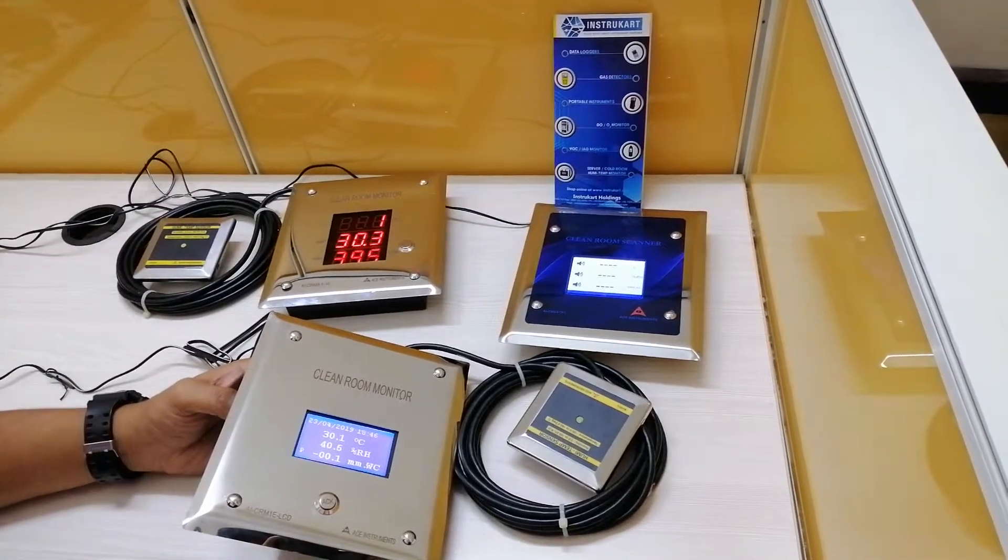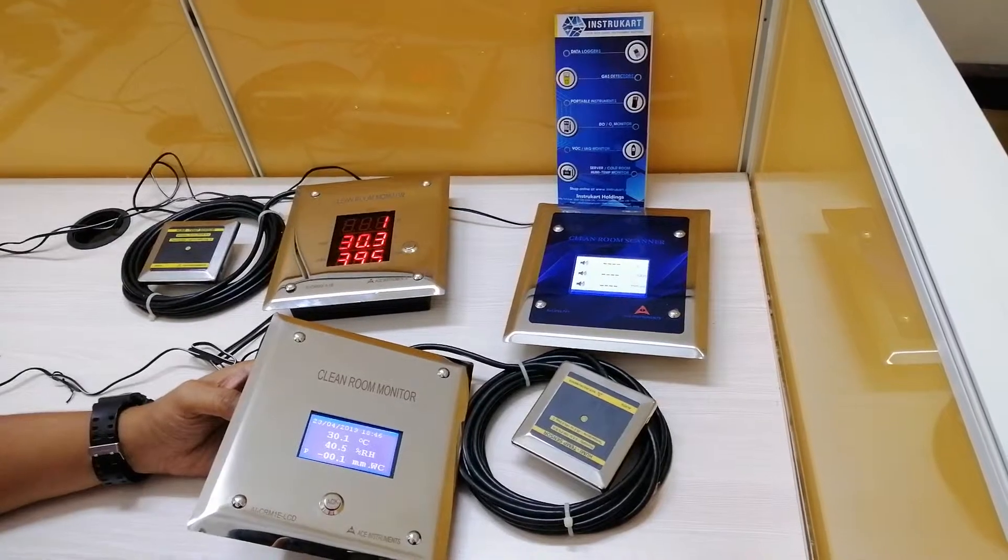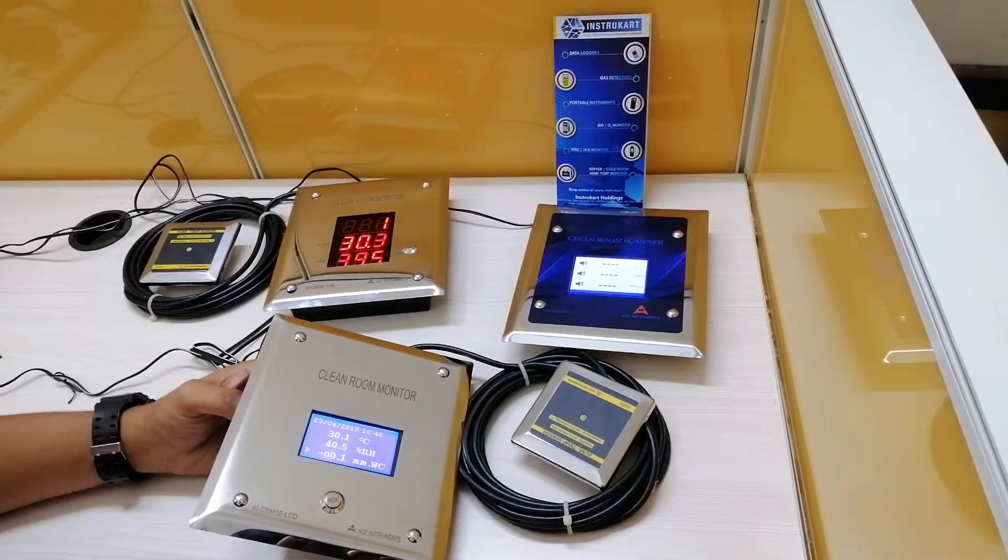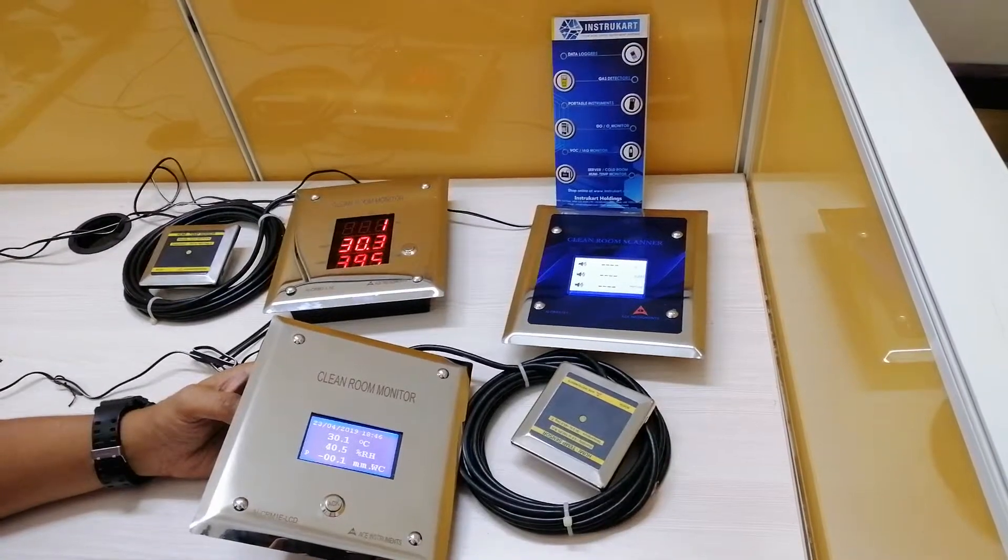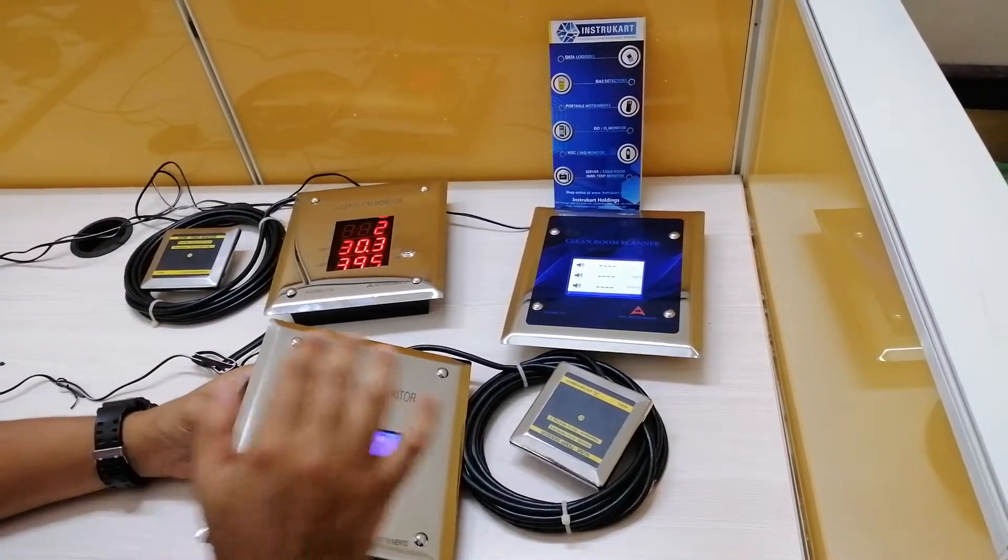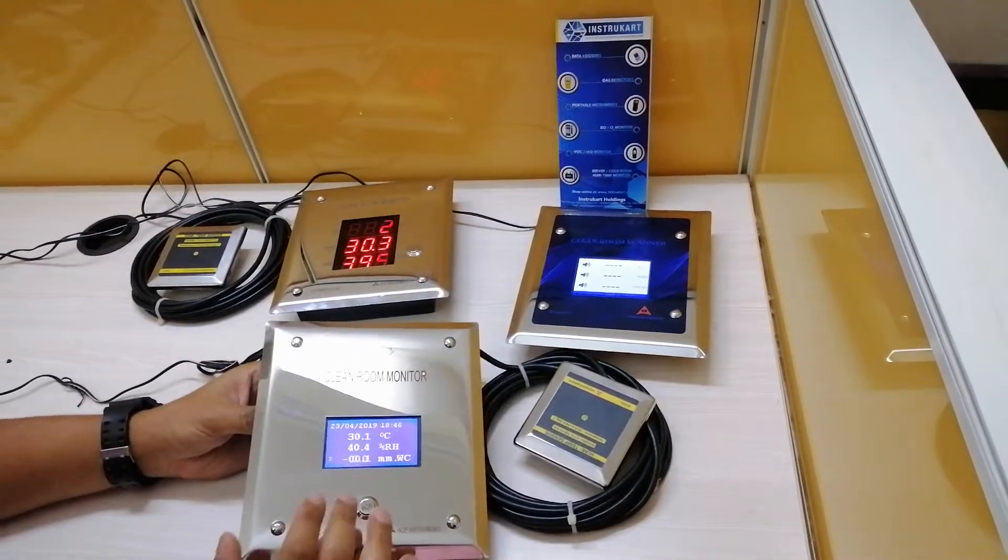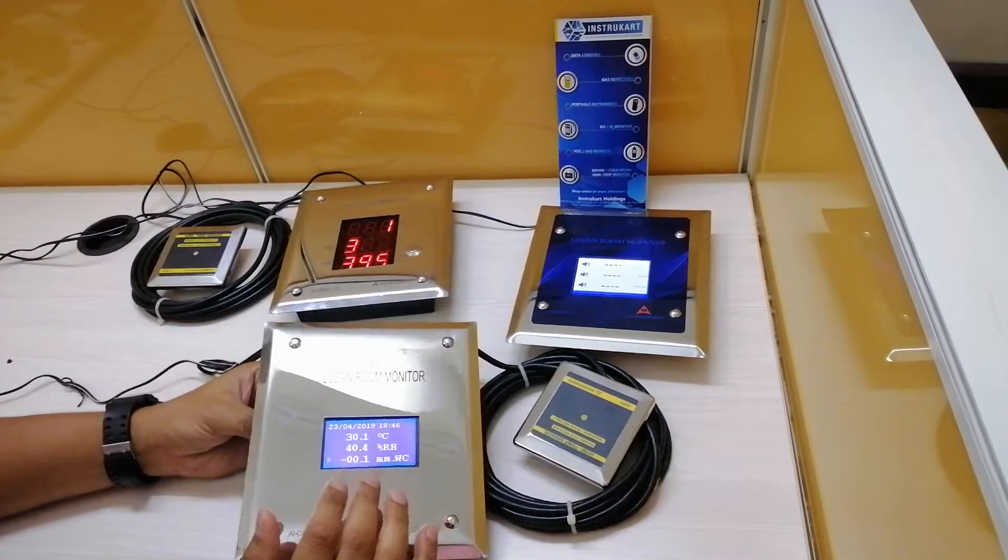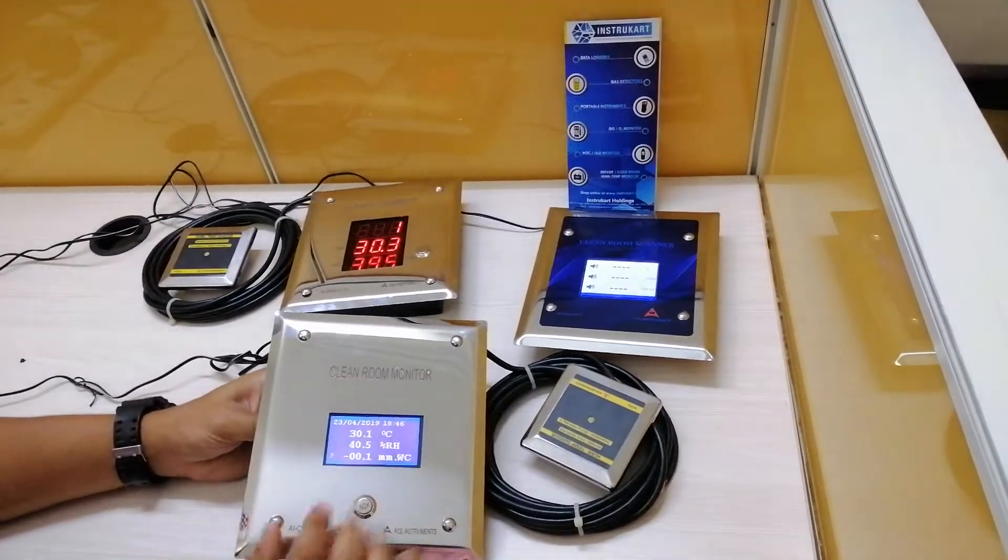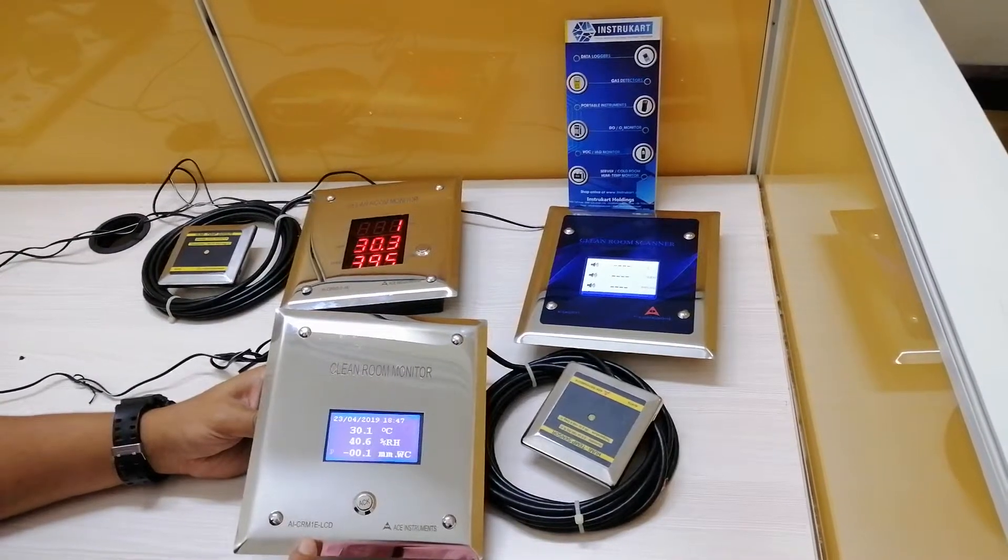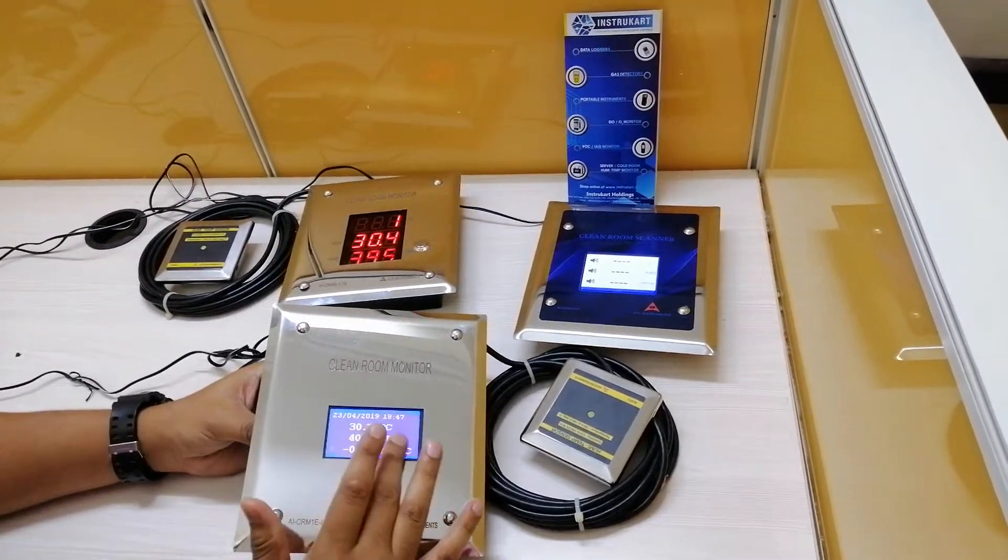Hello and welcome to InstruCart Holdings, your worldwide instrument partner. We have a clean room monitor which measures temperature, humidity, and differential pressure. There are three different models. We'll talk primarily about this clean room monitor with the LCD display. This is the model number AICRM1E LCD, which means that the display is an LCD with a blue background.